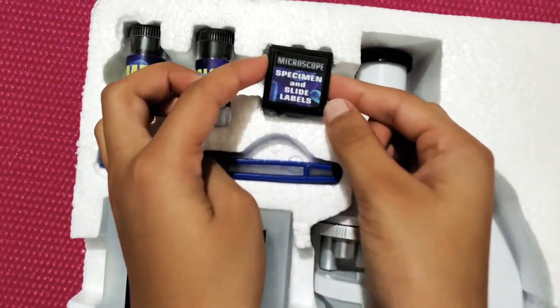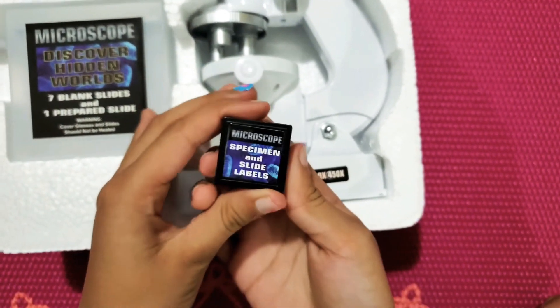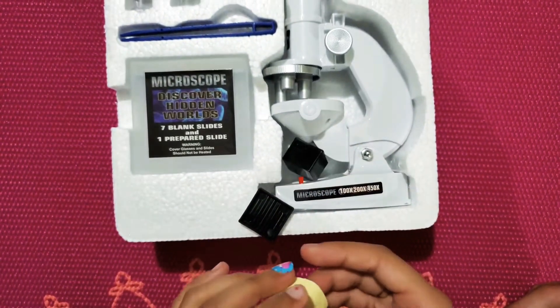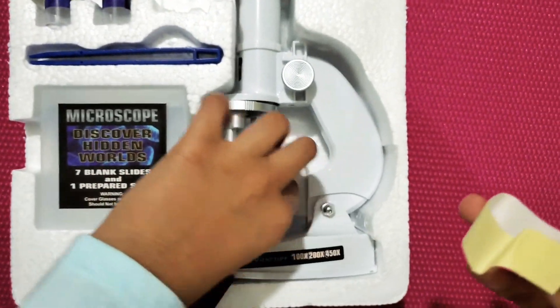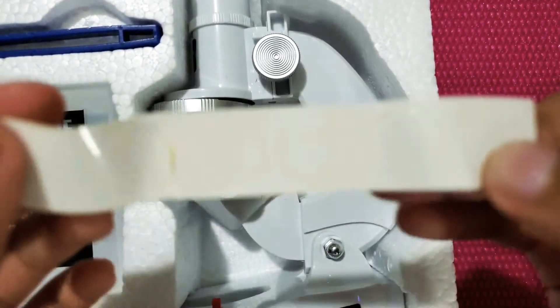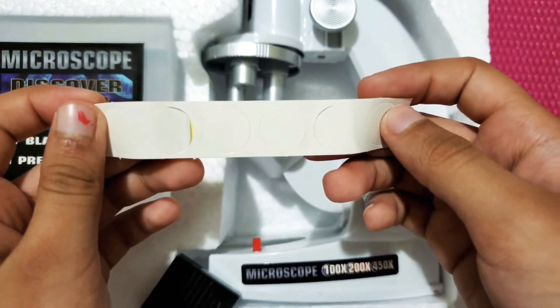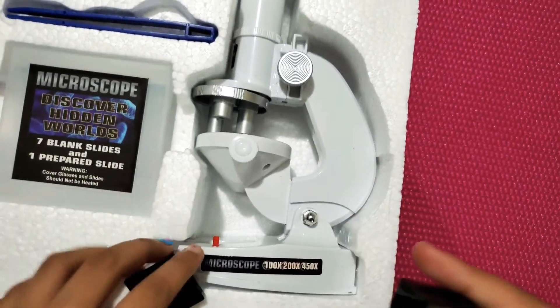Here we have the specimen and slide labels. I wonder what's in this black box — oh, I think these are stickers. Yes, here we have circle stickers. Let's put it back in here.